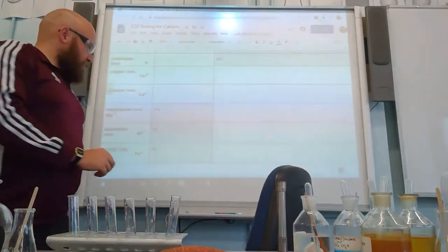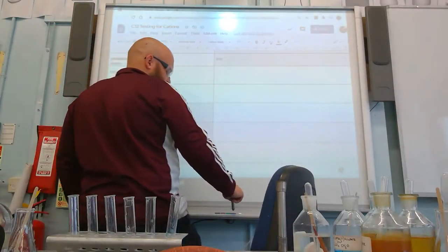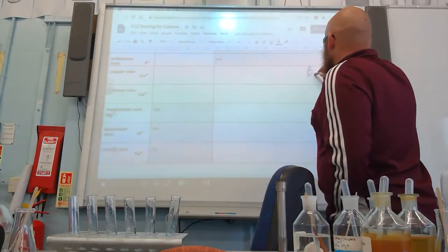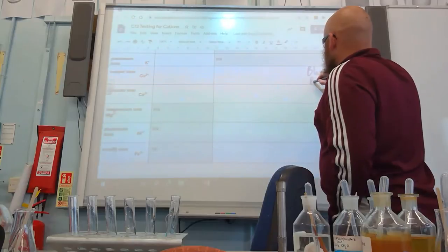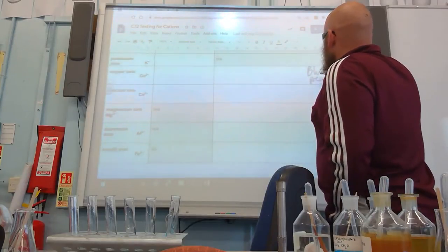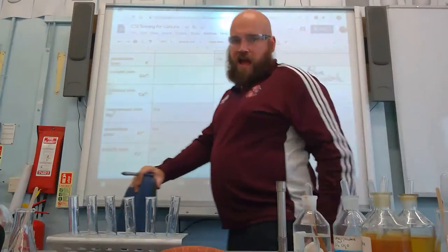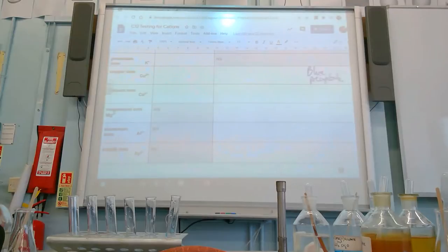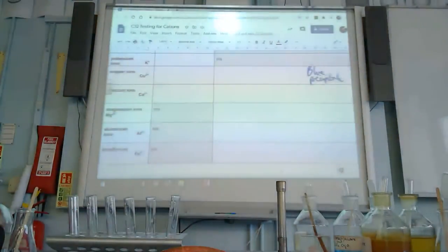Right, so how would I report on this? There's a couple of things I'm going to do here. I'm going to just write blue precipitate at the end. But I'm also going to write an equation to show how it was formed. Okay, so effectively, let's turn the lights up and do this bit.